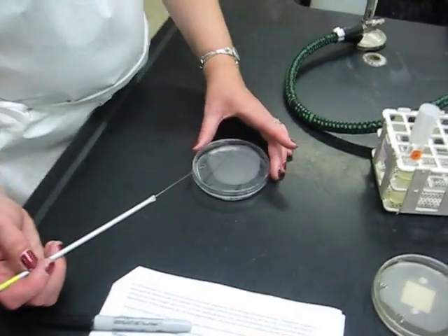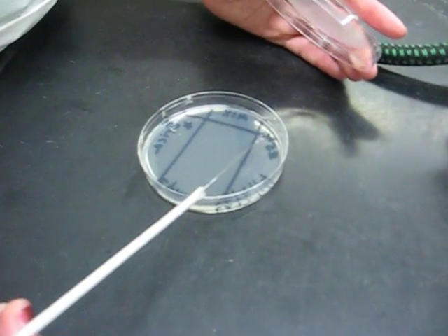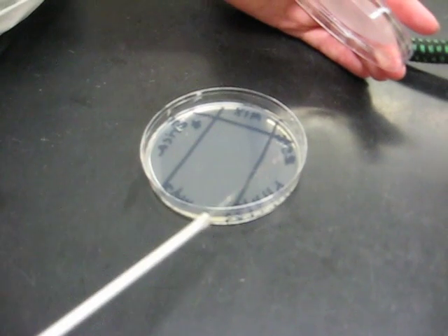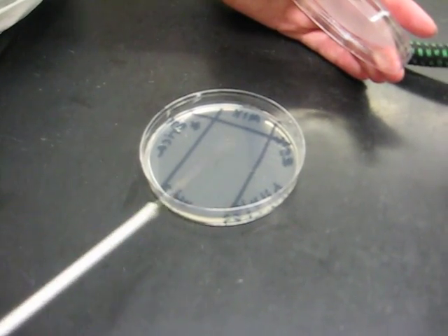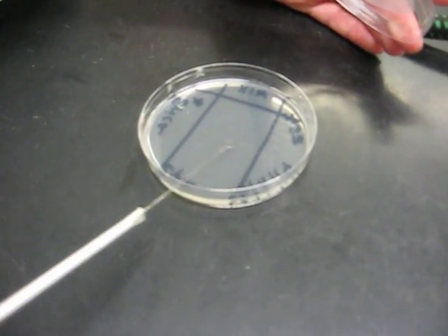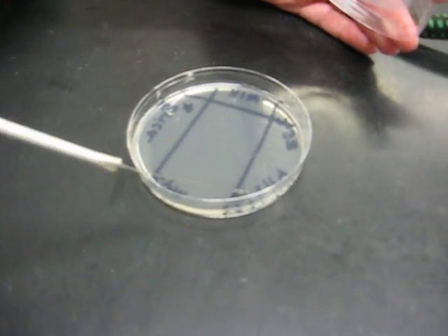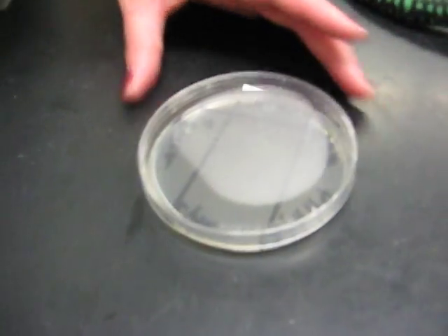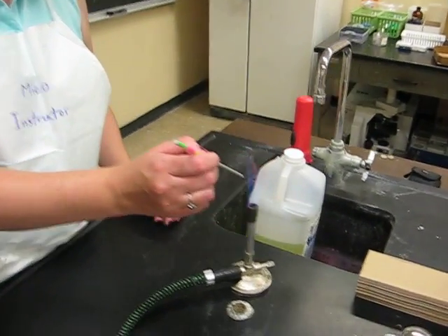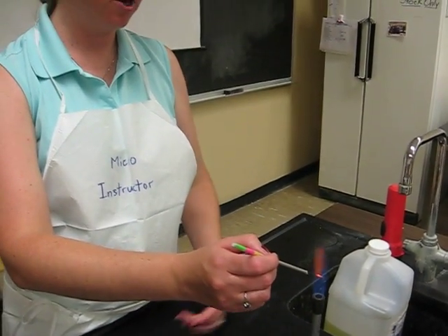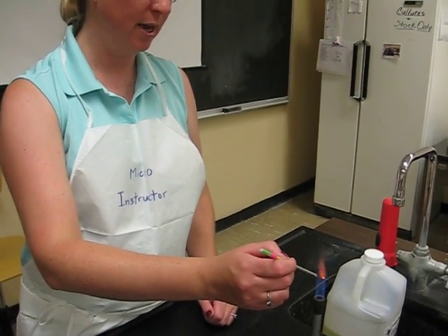Now this one, instead of dragging my loop across, I'm going to start at the top here. And I'm just going to draw lines across from section three into four, all the way down the surface of the plate. So hopefully I'm picking up the least amount of bacteria. So that hopefully the plate later, and of course flaming my loop because I don't want to set this down on my bench top and contaminate. So bacteria gone.